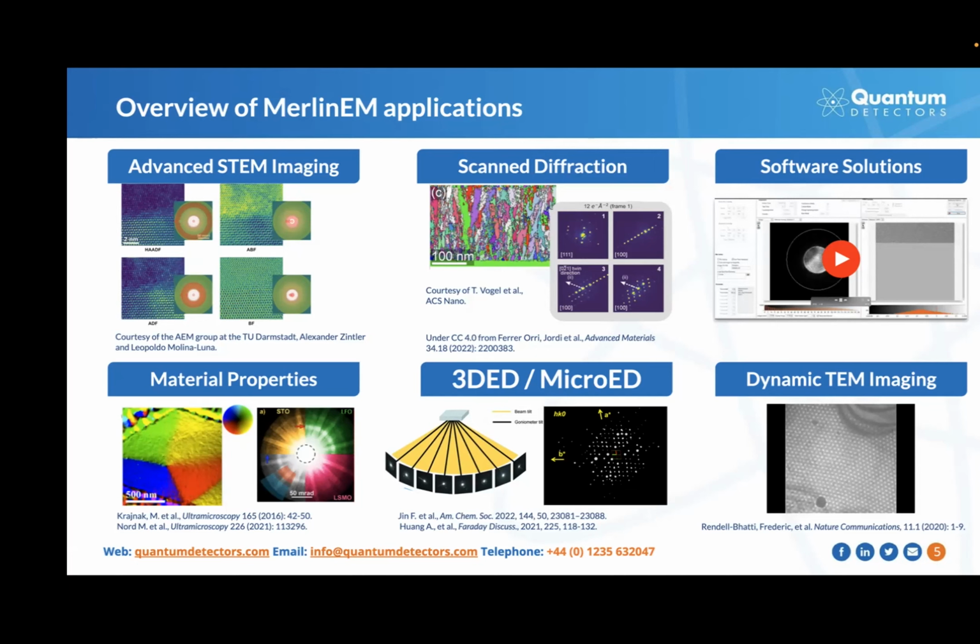There are similar varied applications of Merlin in electron diffraction tomography, 3D ED, micro-ED, which is the topic of today's webinar. It is a method of choice in studying metal organic frameworks, as shown here at the bottom in the middle, or Covalent Organic Frameworks. These frameworks are of great commercial interest, as they are the future of catalysis, of gas storage, or gas vapor separation technologies. They are widely used in biomedical imaging as well, and in luminescence.